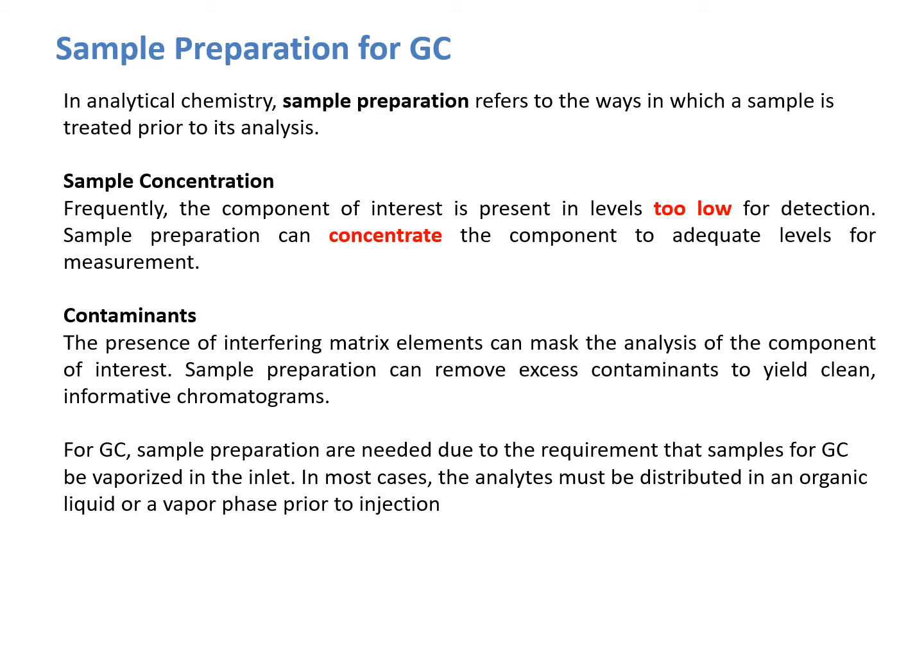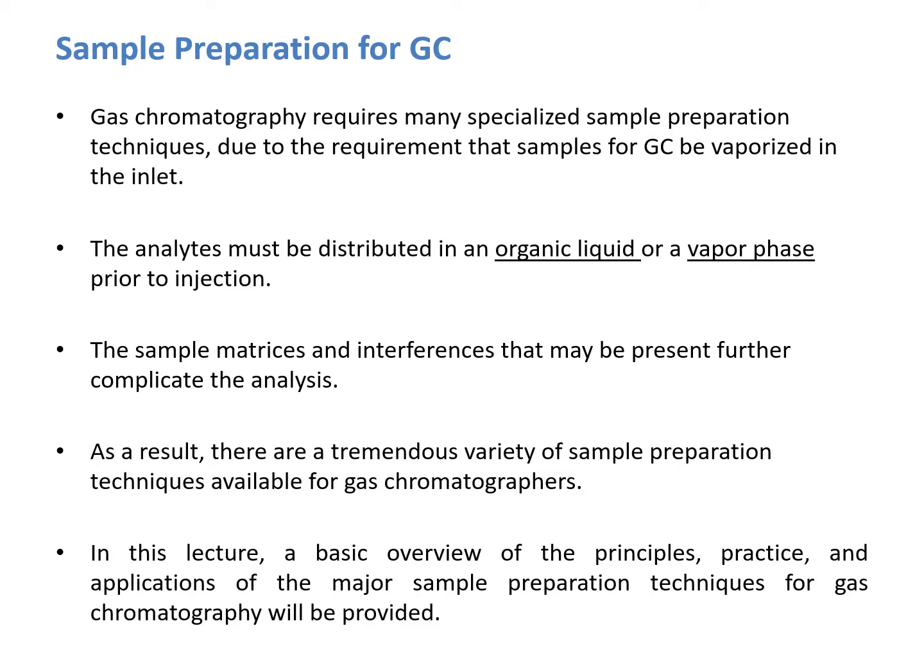For gas chromatography, sample preparation is needed due to the requirement that samples for GC be vaporized in the inlet. In most cases, the analytes must be distributed in an organic liquid or a vapor phase prior to the injection.